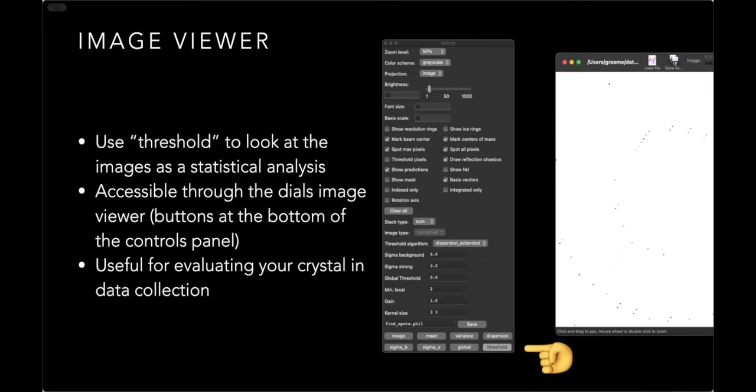With electron diffraction, you have to be really careful that you've got the direction of rotation correct. Because the wavelengths are very short, the Ewald sphere is very flat. So instead of having a nice curved Ewald sphere so you can tell which direction the rotation axis is, with ED data it's often like a pancake that you're rotating, and you are very much constrained on the rotation width that you can have, because it's normally, say, minus 20 to plus 20 degrees on your tilt stage. Other than that, provided that you've got the spot finding parameters correct, most of the steps in Dials work pretty much the same. So yes, we've used the multiplexing on data from eBIC and so forth, doing electron diffraction as well, and it's worked quite well there.